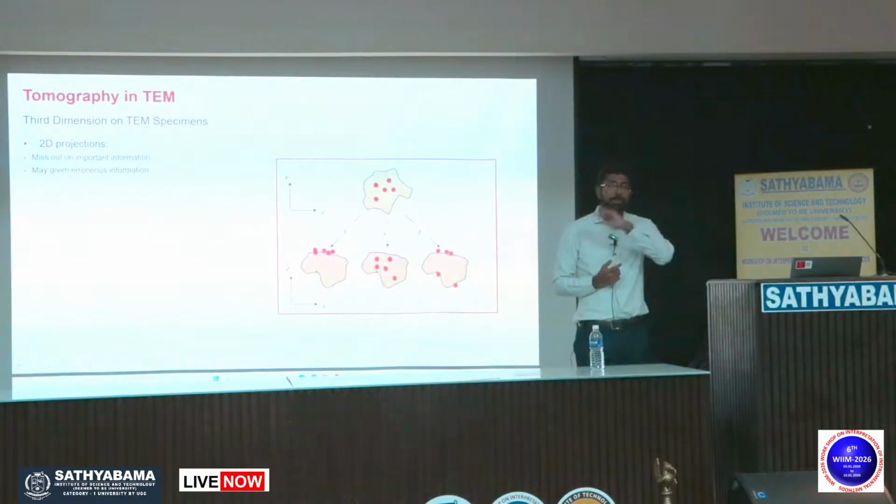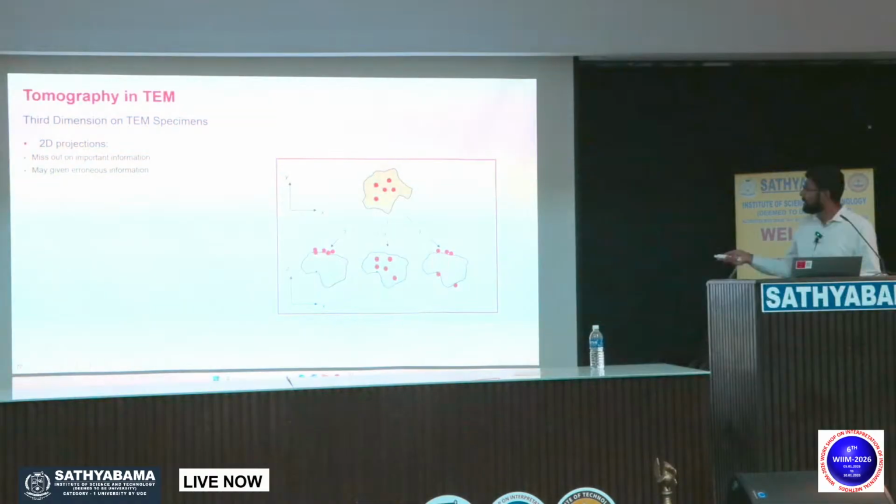With some particle inside. So these are three possibilities. Tell me, after seeing the image, can you answer these questions: whether these particles are above the sample, in between the sample, or mixed distributed, above and below? Do you have any answer for that?